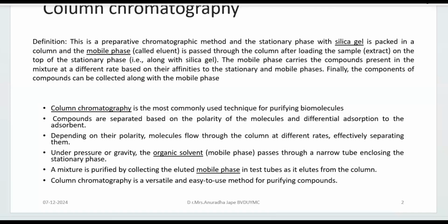So as the mobile phase moves down, the compounds present in the mixture of the sample which is loaded on the column also are going to run down. So it is a commonly used technique for most of the biomolecule separation and purification.